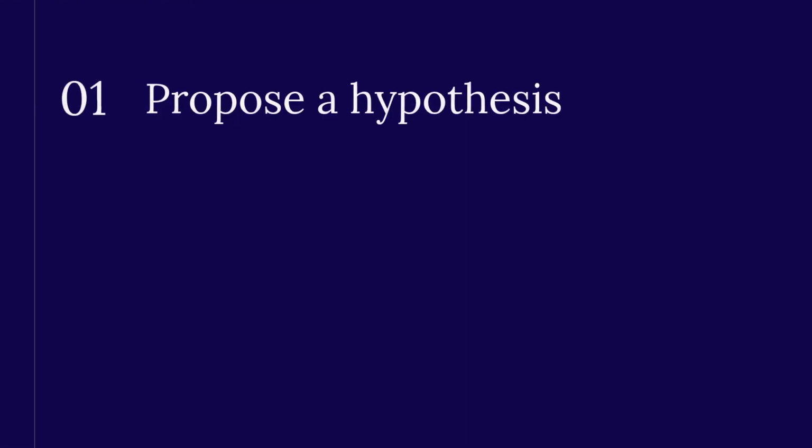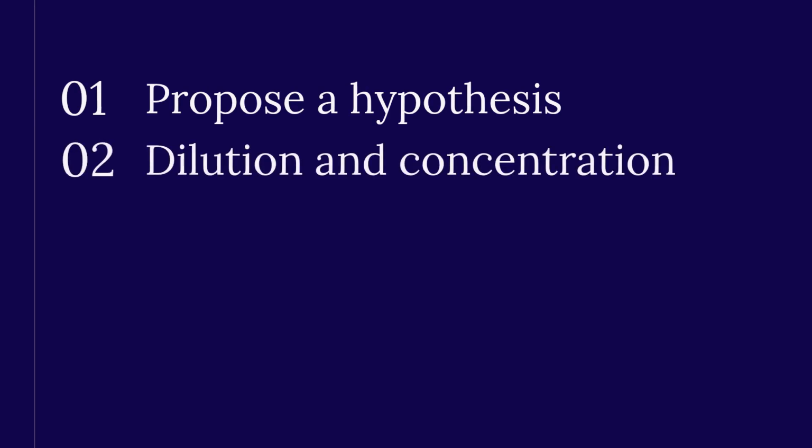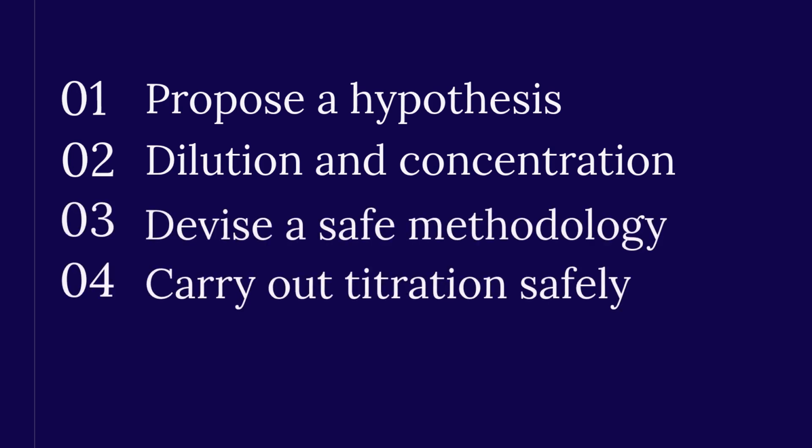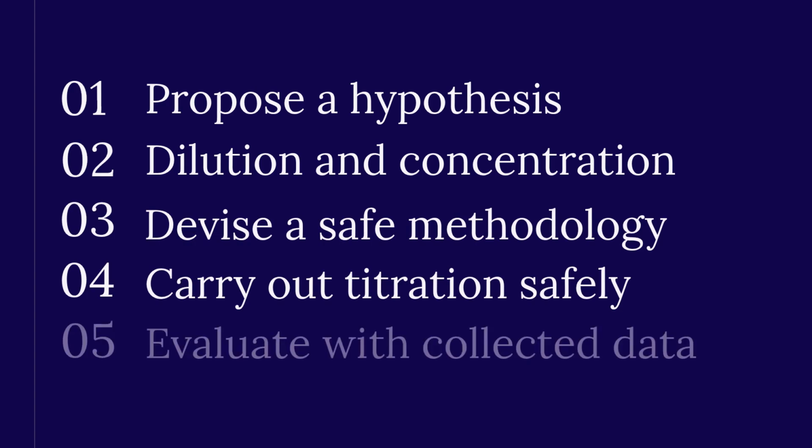Propose a hypothesis about dilution and concentration. Devise a safe methodology, including risk assessment. Carry out titration safely and accurately. Record results in tables and calculations. Evaluate the hypothesis using collected data.